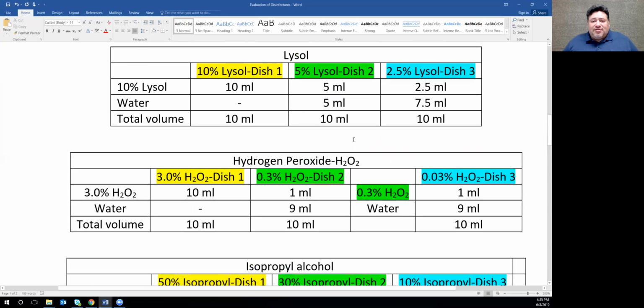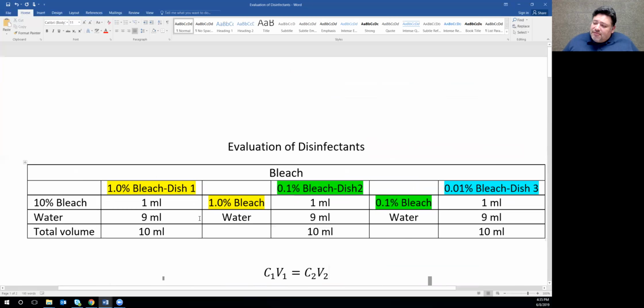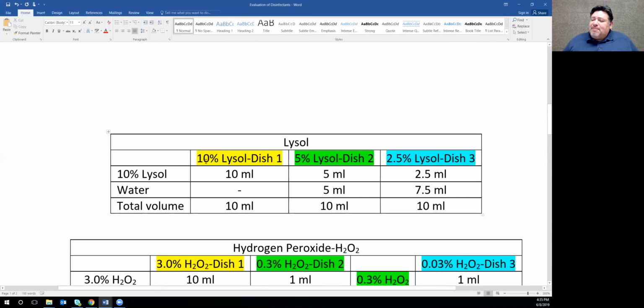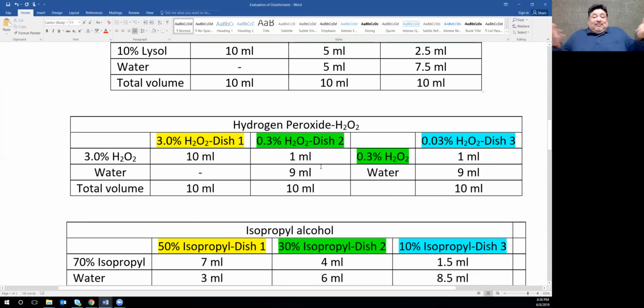So this, again, is why I understand if you guys are getting confused. Because on the first one, we did a dilution. On the second one, we dispensed the same initial solution to all 3 Petri dishes. And on the third one, we did a third different thing. Half of it is we're dispensing the same thing, and then we do a dilution. So the author isn't being uniform, so unless you really know what's going on, it's really easy to get lost. So I can understand if you're having problems with this, okay?